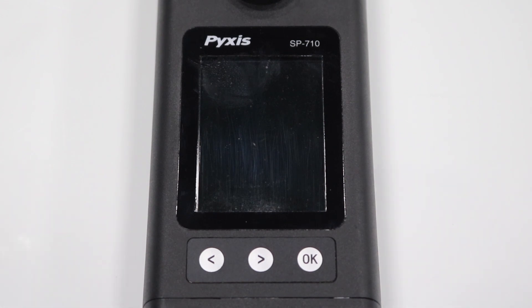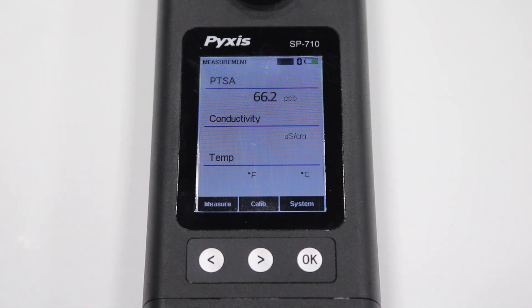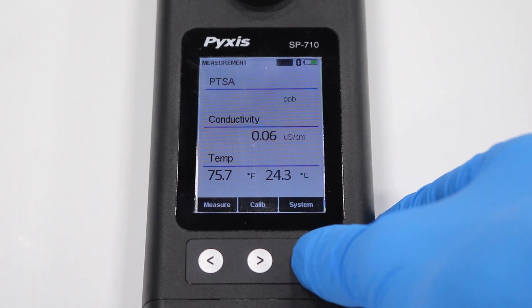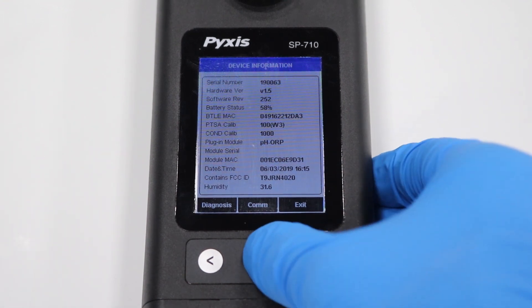Then press the OK button to power on the multimeter unit. Press the OK button again to access system settings. Then press the right arrow button to select COM.